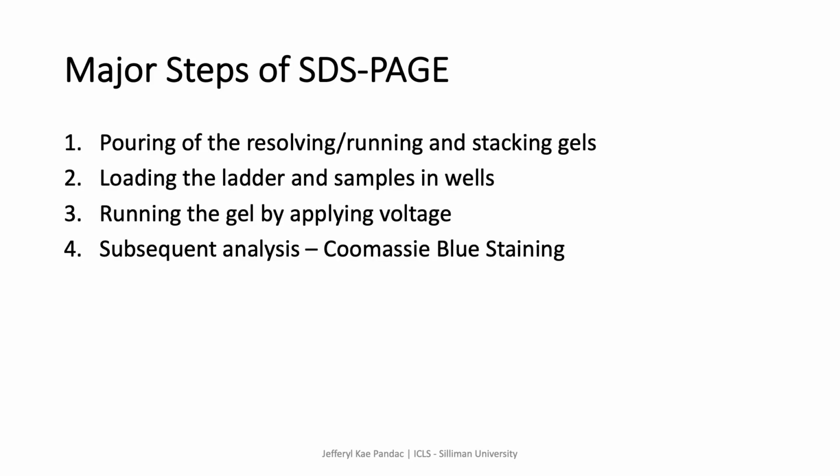In performing SDS-PAGE, there are 4 major steps. These are: first, pouring the resolving or running and stacking gels; second, loading the ladder and samples into the wells; third, running the gel by applying the voltage; and lastly, subsequent analysis by employing Coomassie blue staining.